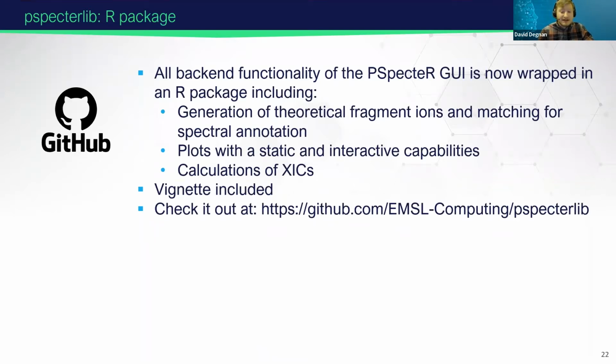In separate projects that are interested in comparing top-down database search tools, I've used the functions on the back end for making those heat maps of the feature identification. And in a separate project as well, I've used the ability to calculate the ion intensities for the MS1s for several different modifications, for those interested in more MS1 proteoform quantification techniques, which is not covered in this talk.